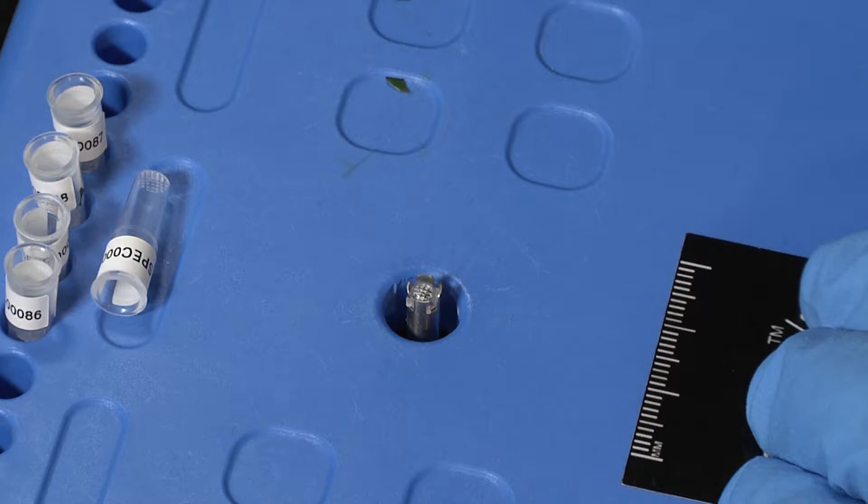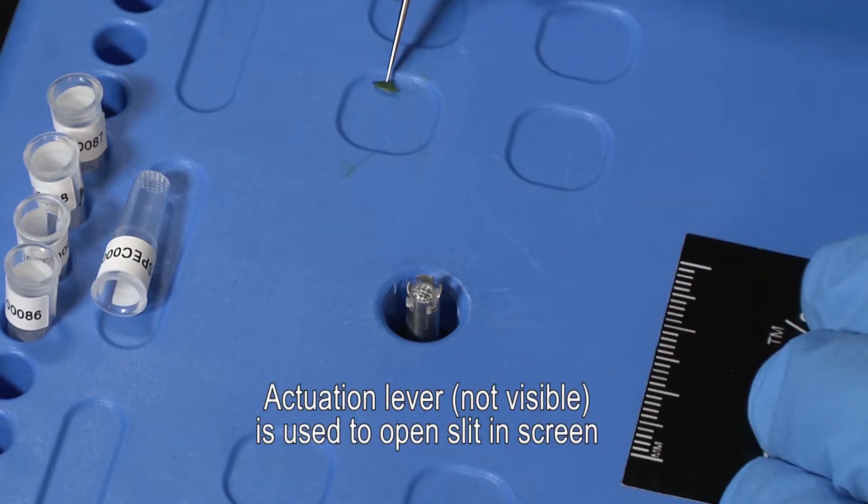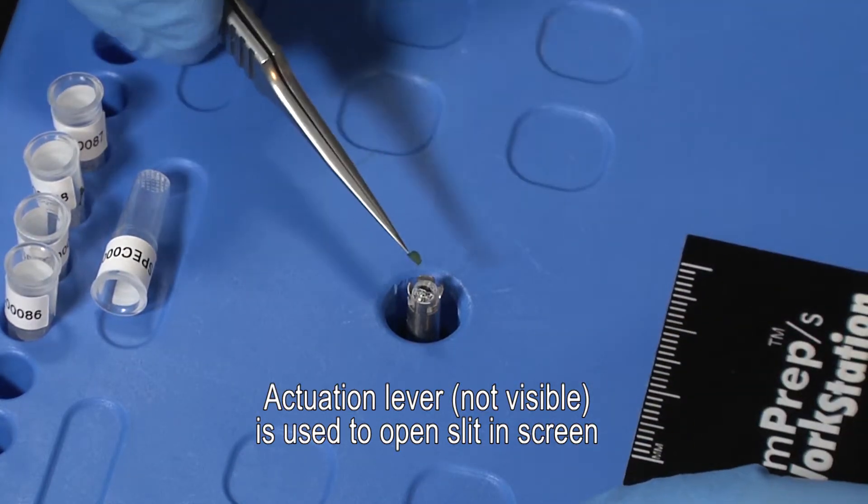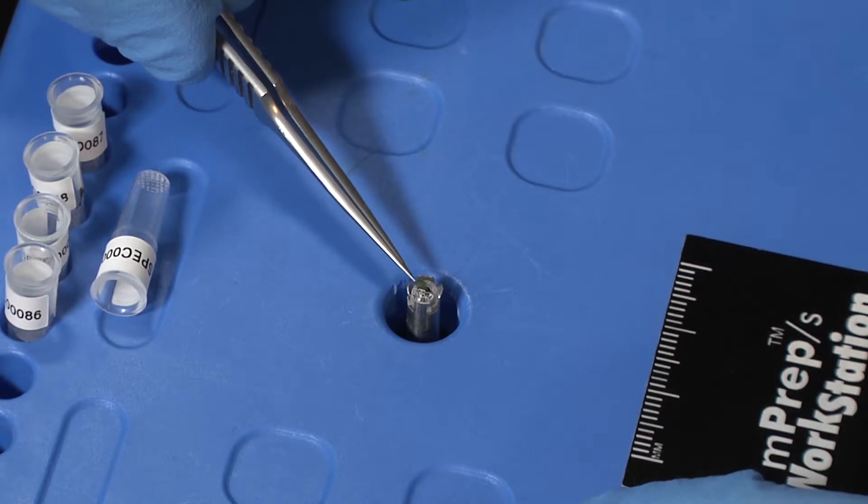With a little practice, this can be done very quickly by feel. To pinch mount a specimen, simply press down on the actuation lever to open the slit. Then insert the specimen and release the lever to clamp the back end.